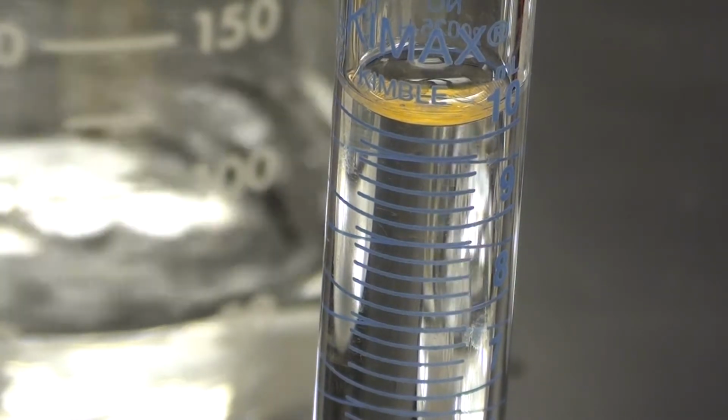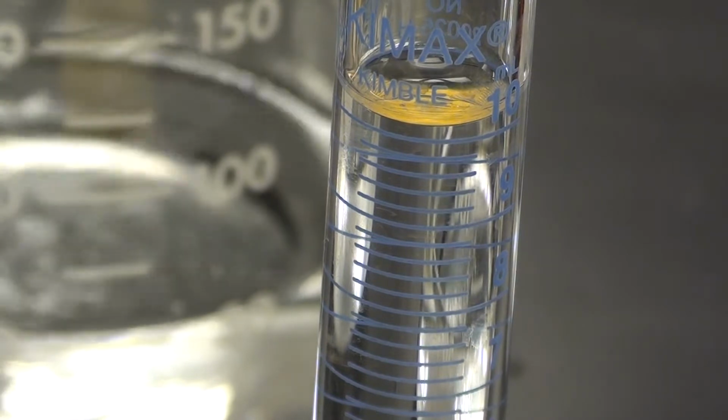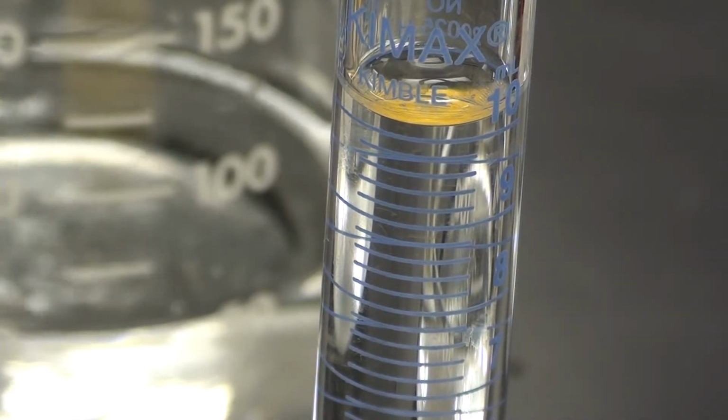So how do you feel about that? Pretty good. Okay, so the meniscus now is on the 10 mark. The bottom part of the U shape that we're getting here is going to be down there. So let me show you a little bit of technique here with the pipette.